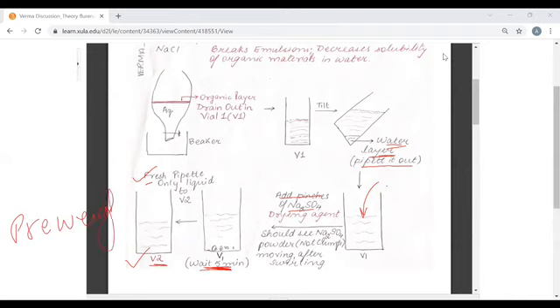You should weigh it when it is empty, so that with a fresh pipette, you will only collect the liquid from V1 and transfer it to your pre-weighed vial V2. With this, you will only be getting your product, your pure, clean product.